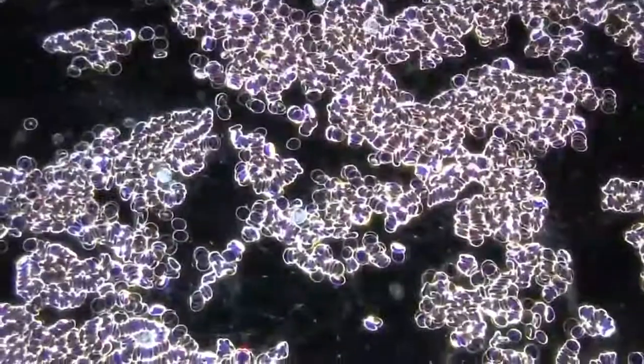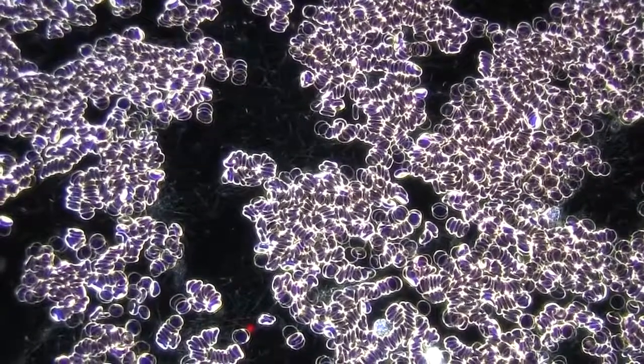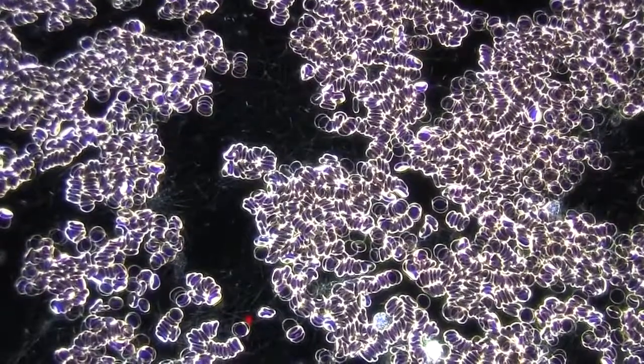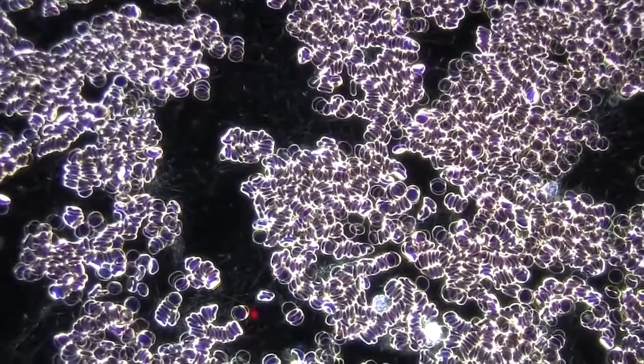Also, we have a lot of inflammation in the background. You can see the sort of spider web formation in the background. That's inflammation. That can be caused by injury to the tissues. It can be caused by stress. It can be caused by the liver not working properly and filtering the blood. Multiple causes of that too.